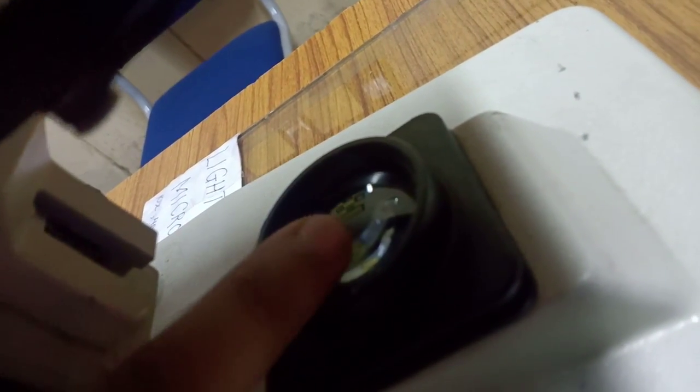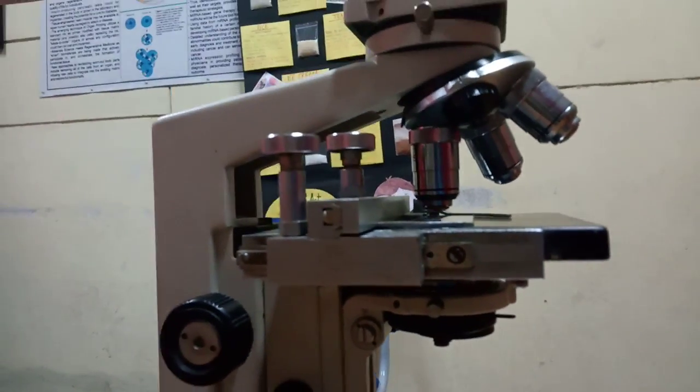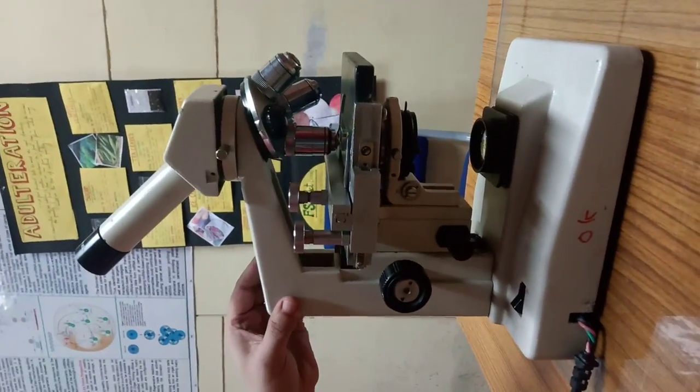The light beam is focused and condensed with the help of the condenser, so it strikes straight through the object to the objective lens, through the condenser, through the object, and then through the objective lens, all through the body tube, the magnified image to the retina. This view is captured by your retina.